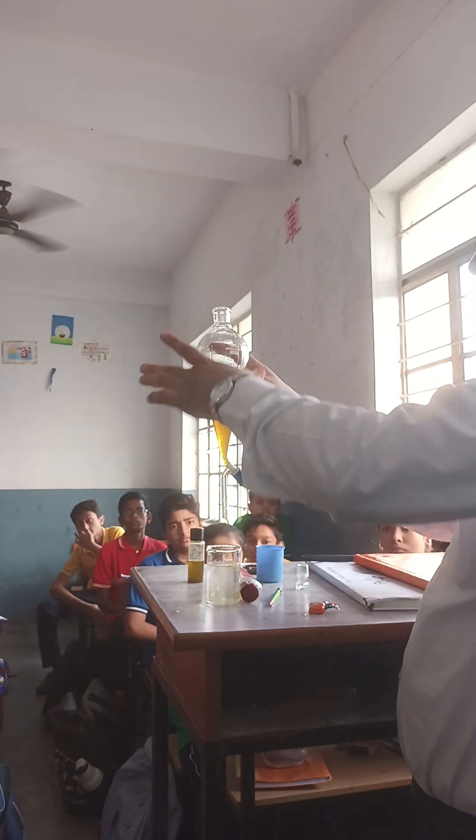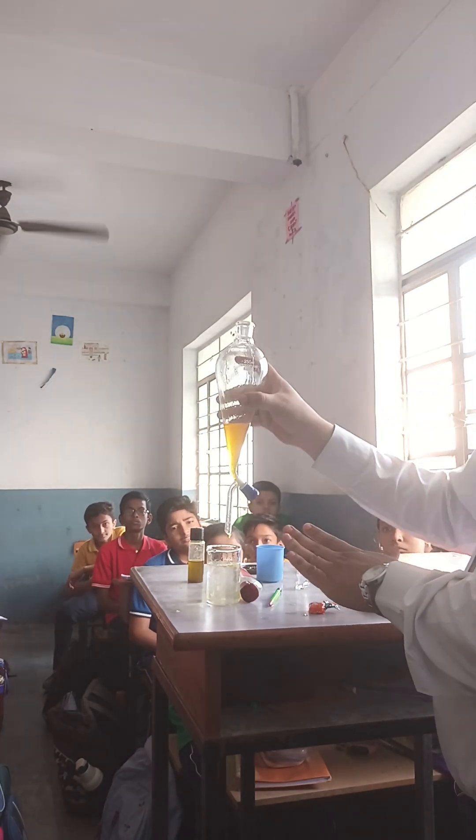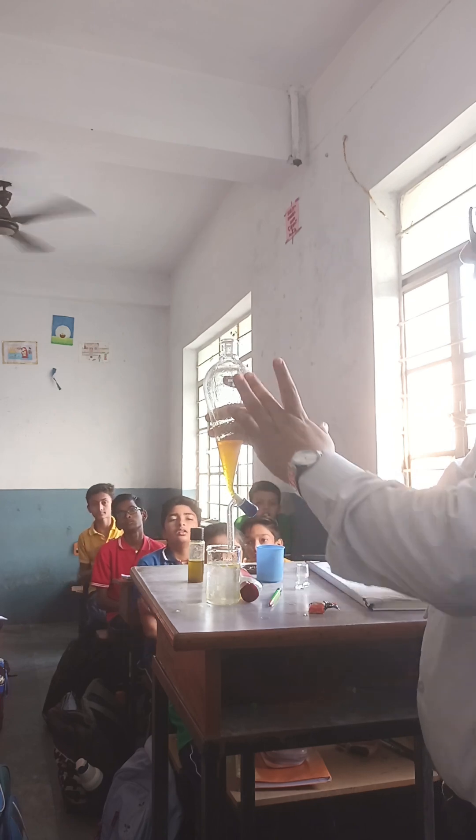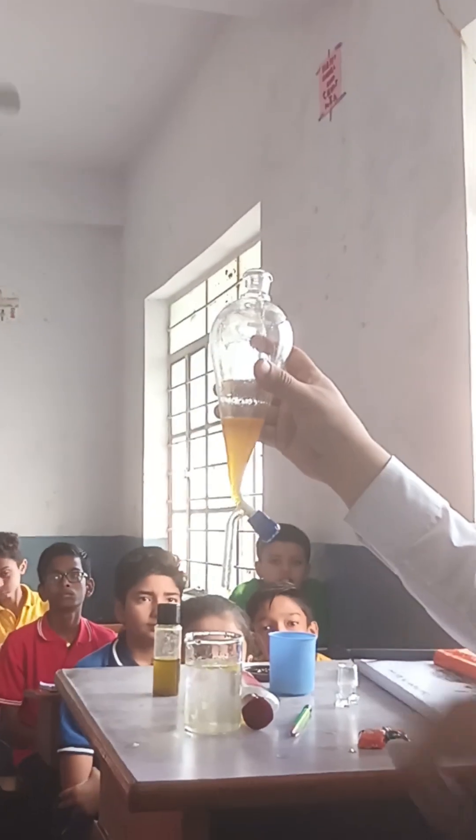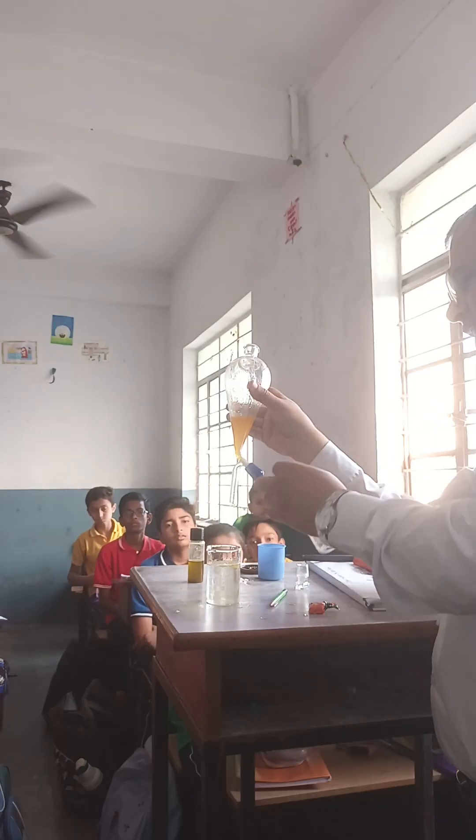Mustard oil is separated. Water is in this beaker and mustard oil remains in the separating funnel. Now put the mustard oil in this container.